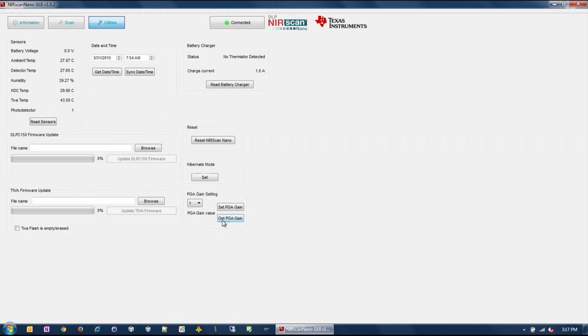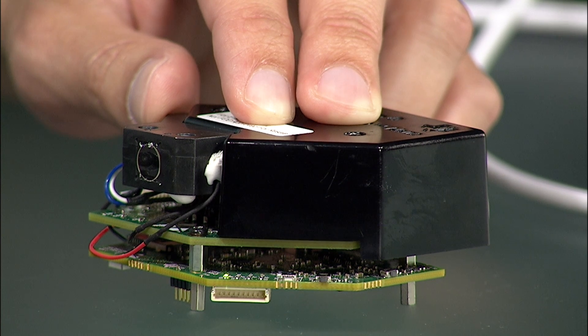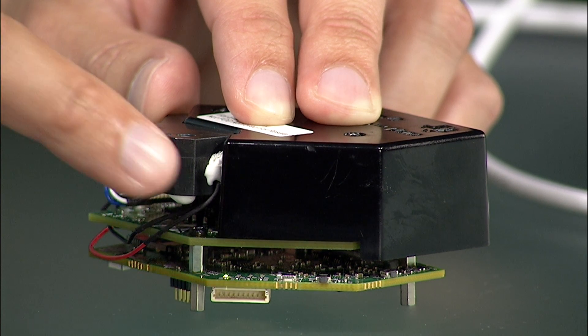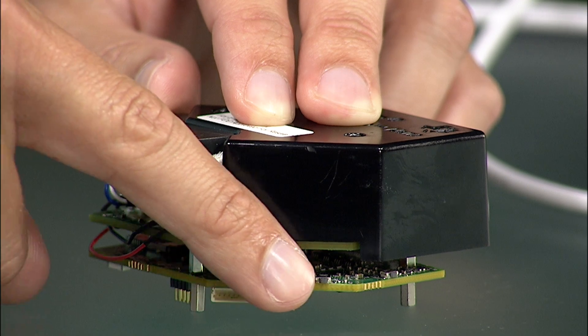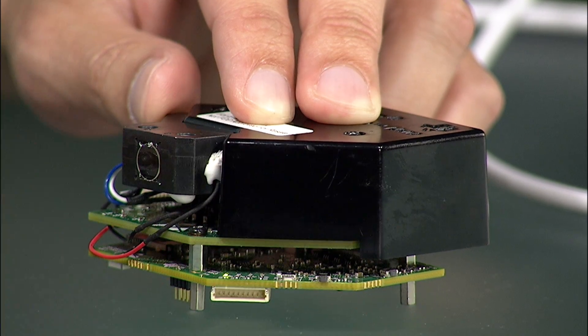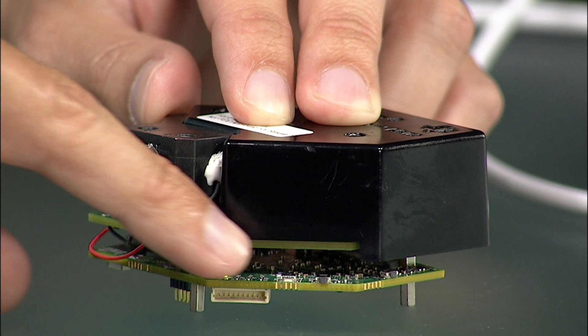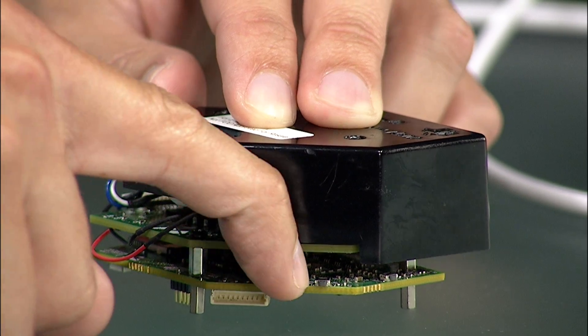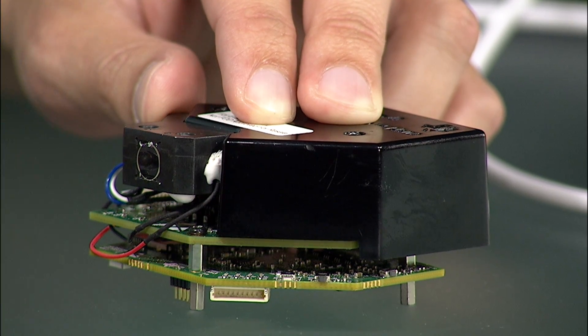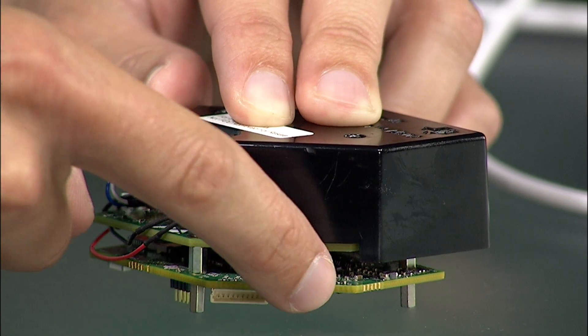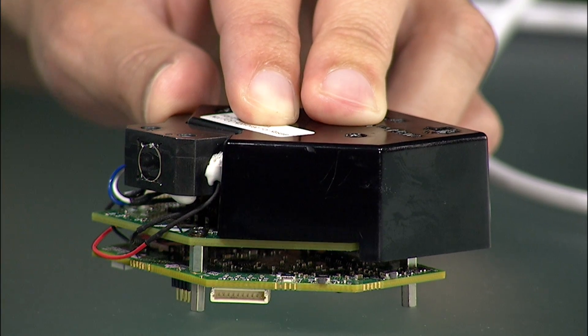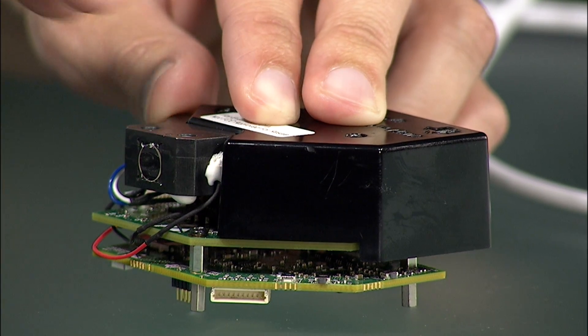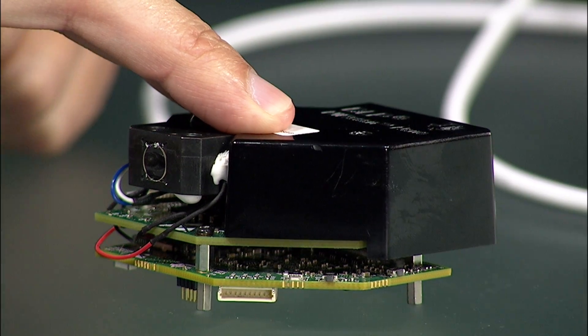The DLP Nearscan Nano EVM includes three hardware buttons: Reset, Wake, and Scanner Bluetooth. The Reset button performs a hardware reset of the Nearscan Nano system. The Wake button will wake up the system from hibernation mode when it is in standby mode. Upon wake up, the green LED will pulse on and off.